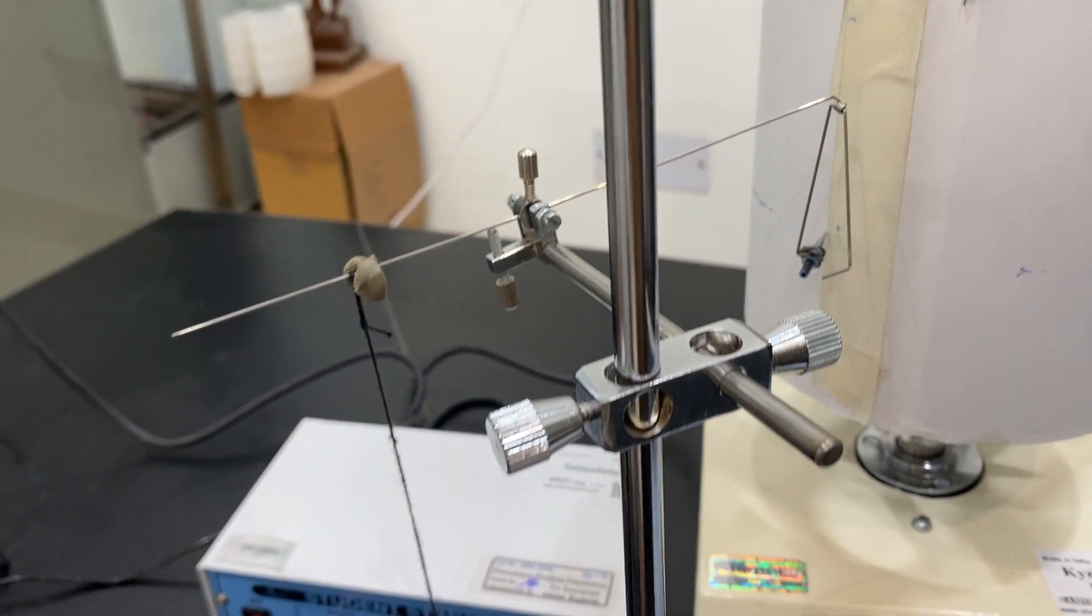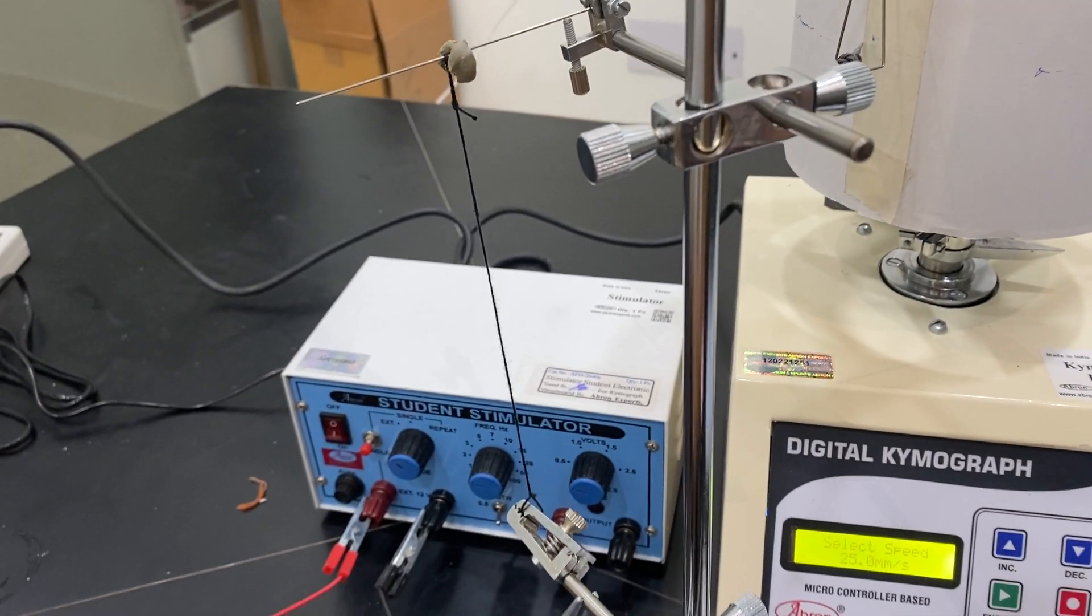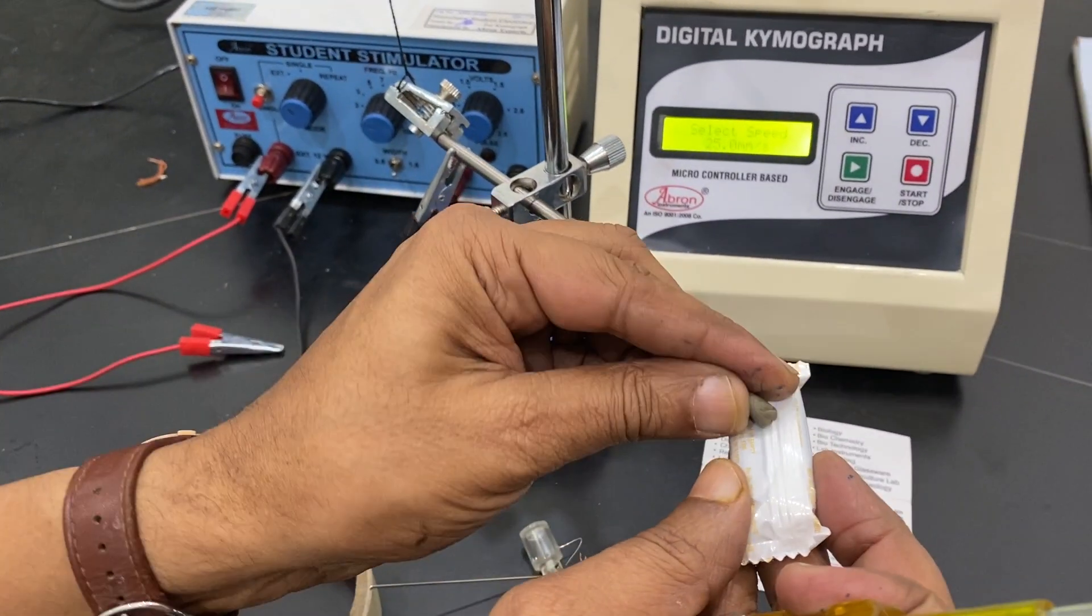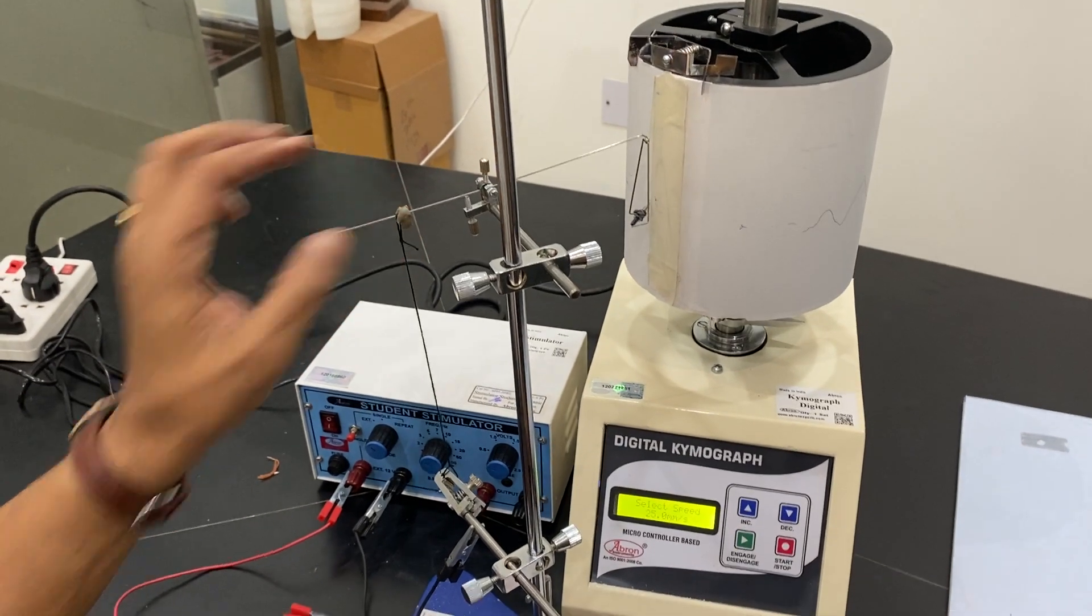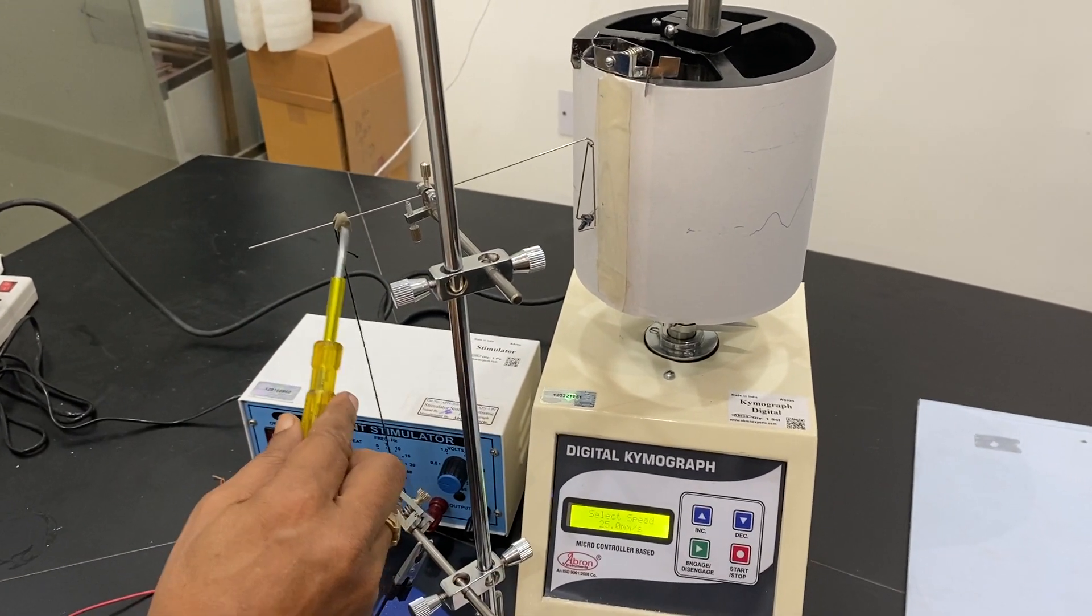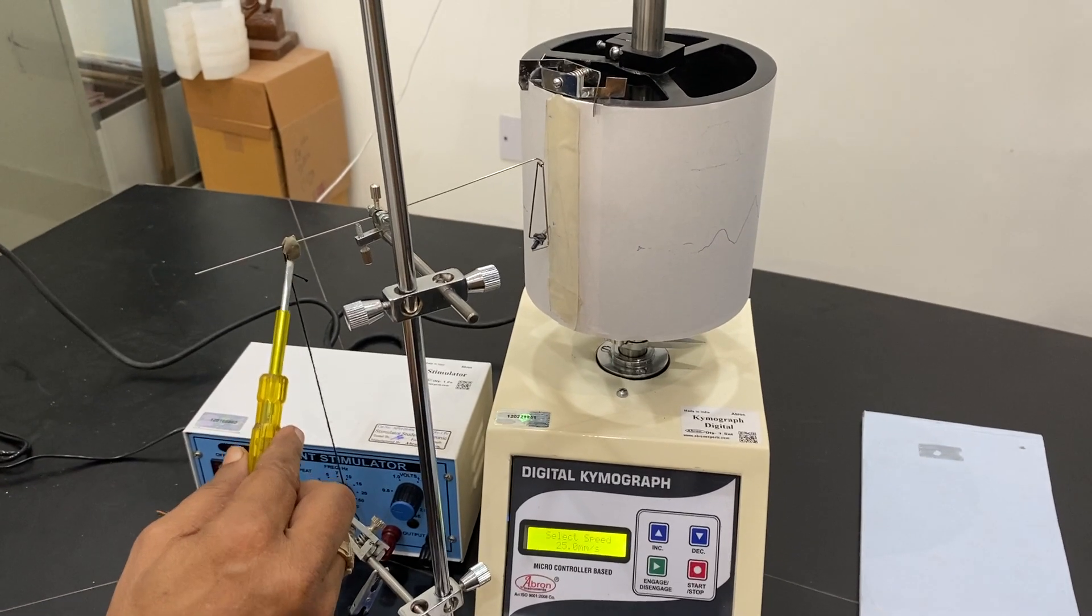Now I have used this M seal kind of material. I have made a ball and kept it here as a counter balance. It works for two uses, one for counter balance, another for holding the muscle.